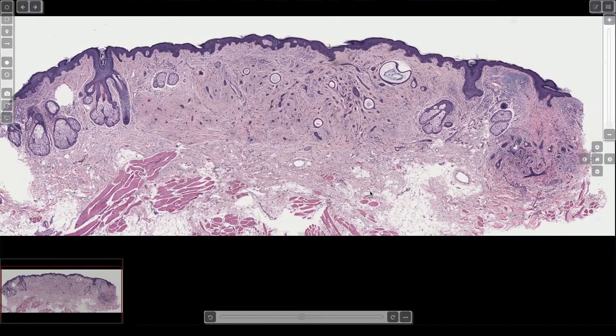What if you see a bunch of smooth muscle in the dermis — more than the usual amount for erector pili? You might see a couple strands normally, but if you see a lot of smooth muscle in the dermis, where are you? Genital skin — specifically nipple areola, labia majora, or scrotum. Those are the areas with abundant smooth muscle in the dermis.